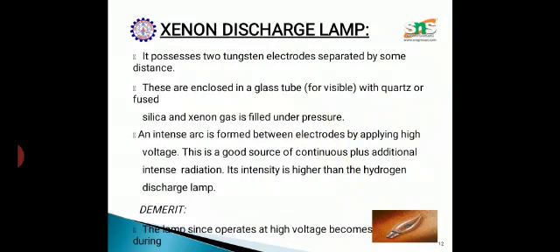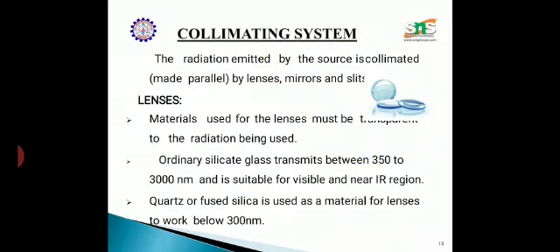So no need to explain these things in your exam. You just mention the source of light. You have three different sources: the hydrogen lamp, the ordinary filament lamp, the xenon discharge lamp, etc.